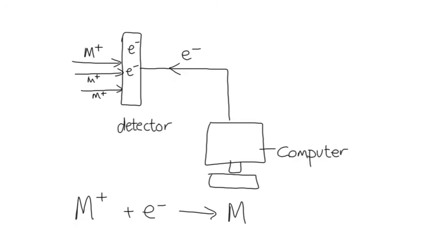And so when we get our mass spectrum out on our computer screen, we often see these little peaks. Now, the bigger the peak at that particular mass, the more of that sample there is. So in this example, where I've put that bigger peak at 24, it was bigger because more electrons were drawn at that mass, and so a bigger current was detected, and the computer drew a bigger peak. The smaller the peak, the less abundant that mass is in my sample.